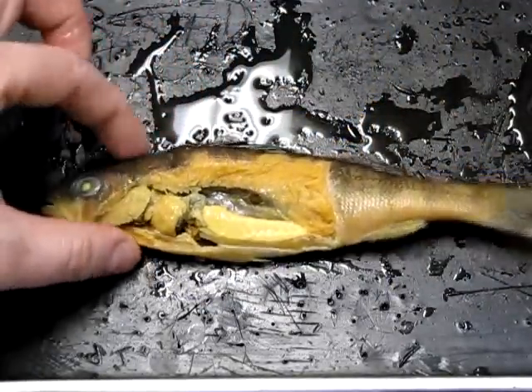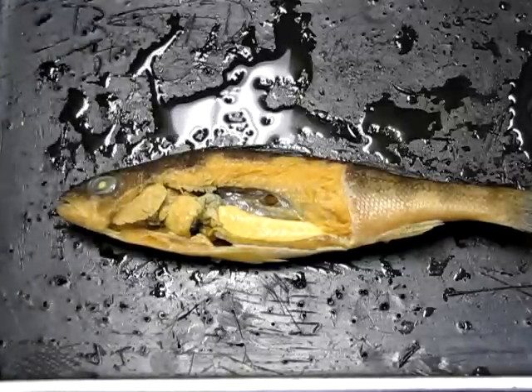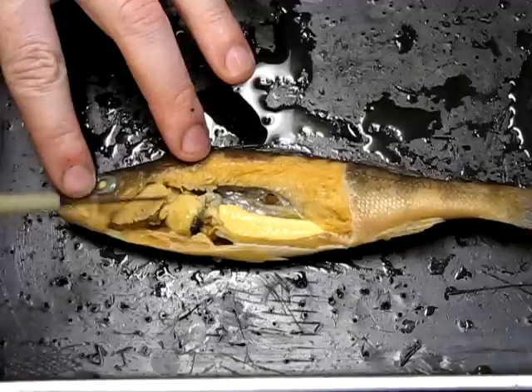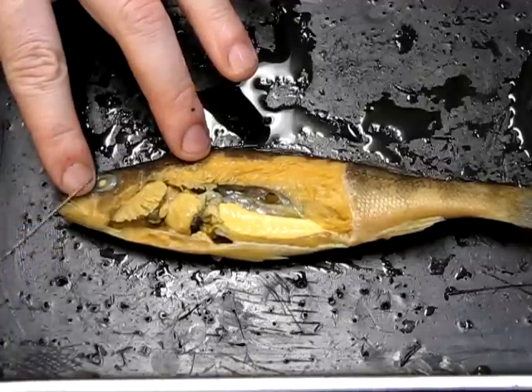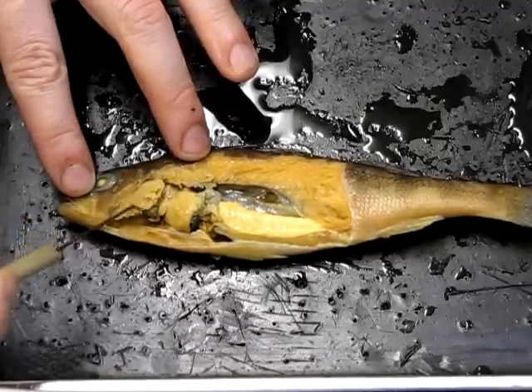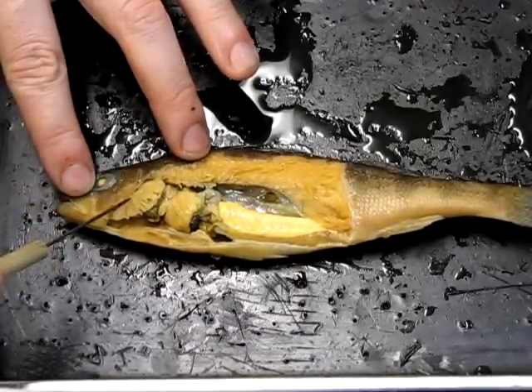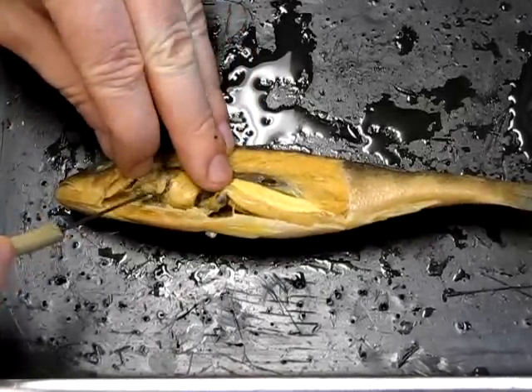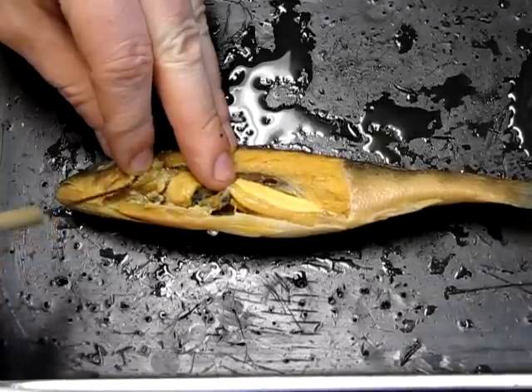Now let's look at the internal anatomy. We'll start with a male and then move to the female. Up at the front we can see the delicate feathery gills, which are the surface for oxygen and gas exchange — you can appreciate why the operculum is a useful adaptation. Below the gills we should be able to find the heart.